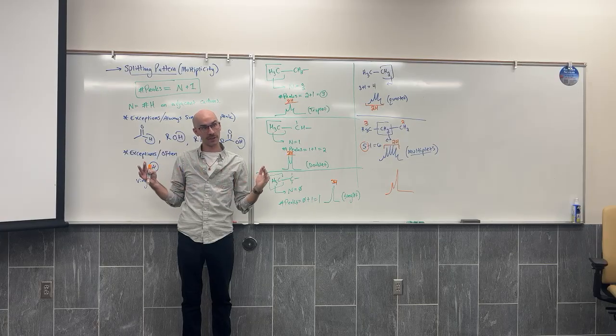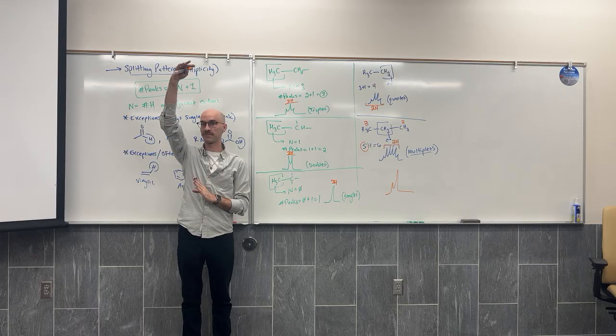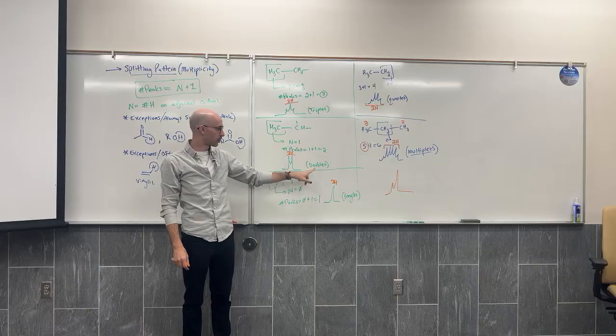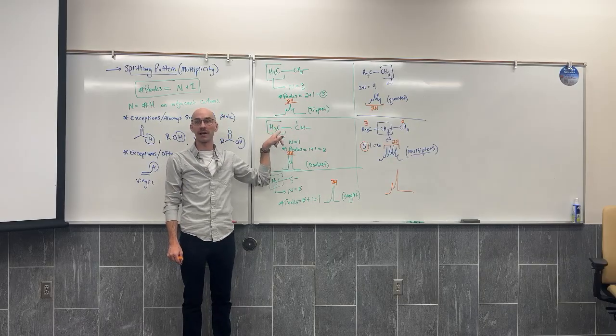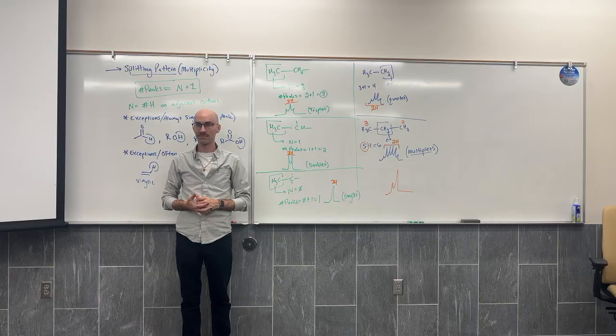It's not spread out across multiple peaks, but it has to have the same area. So if it's not making up that area in width, it has to make up that area in height. The widest because it has the most peaks, the tallest because it has the least peaks, all the same area. Great. Because they're all 3H. Fun stuff, right?